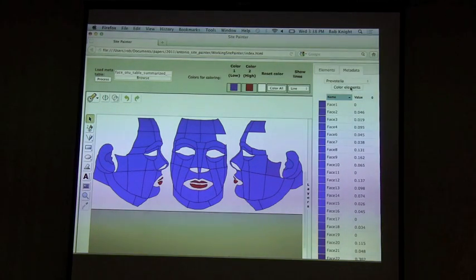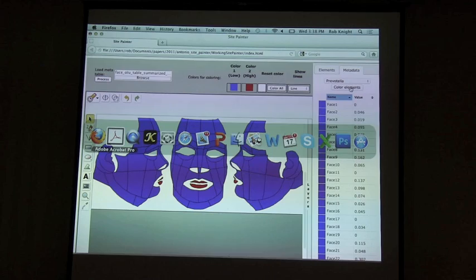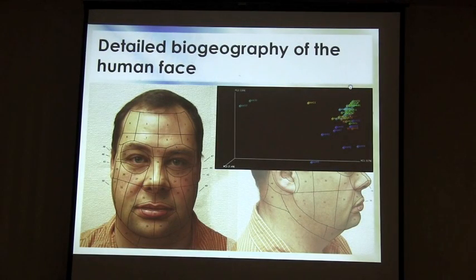And again, you can come up with your own scenario for how those oral bacteria might have got there, right? So by linking QIIME up to other tools, you can get this additional power to look at spatial patterning, and Antonio and Yoshiki especially have also been putting together a lot of time series tools that let us do more statistics on the time series data that's now starting to come in.